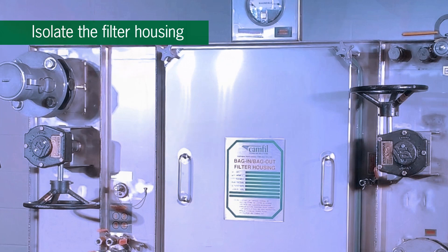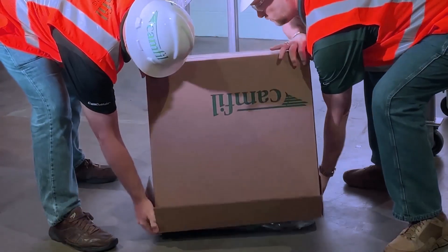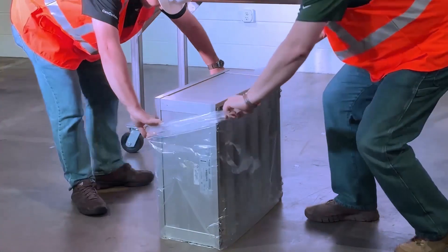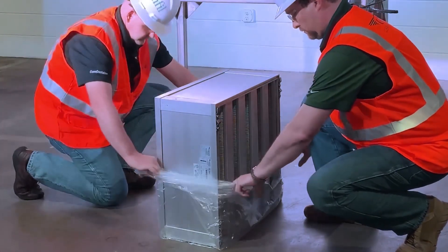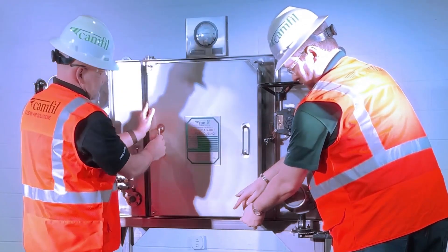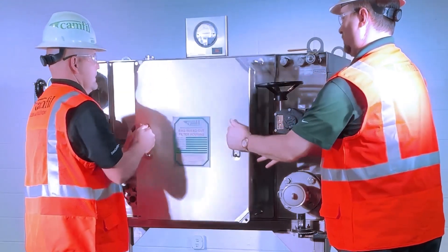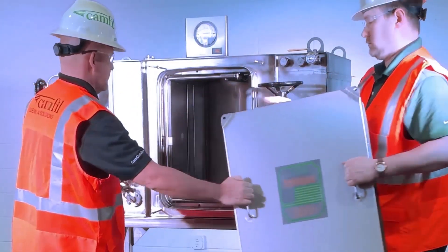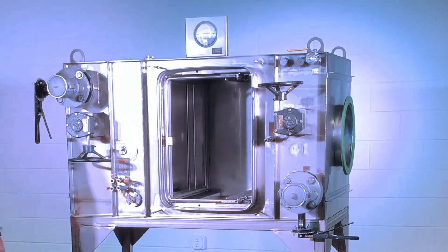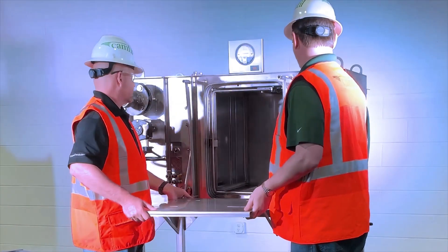Isolate the filter housing by closing the upstream and downstream dampers. Unpackage the new filter in accordance with CAMFIL instructions. Open the filter access door by removing the four door knobs and pulling it towards yourself to remove. Place it in a safe location to protect the door gasket during filter installation. Install a CAMFIL change-out shelf to assist in the change-out process.